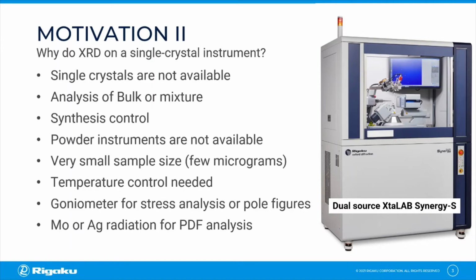Why and when should you use your single crystal diffractometer for powder diffraction? Sometimes single crystals are simply not available from your synthesis, or you already know the structure and you want to control your synthesis outcome without performing a sometimes time-consuming crystallization. Under these circumstances, you want to perform a powder diffraction experiment.